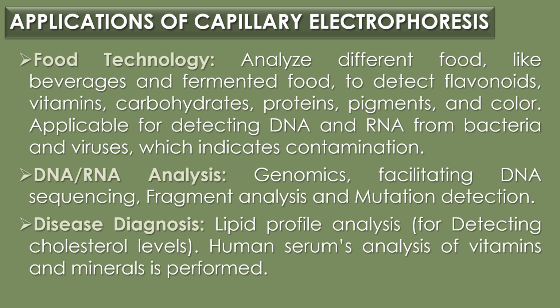Applications of capillary electrophoresis. Capillary electrophoresis is commonly applied in various fields. It includes analyzing foods and food contents, genetic differentiation, and clinical diagnosis. The following is the detailed explanation of the areas of application of capillary electrophoresis. First, food technology.